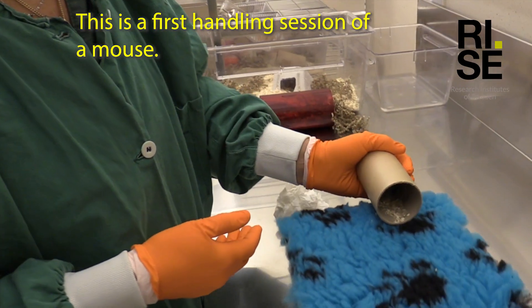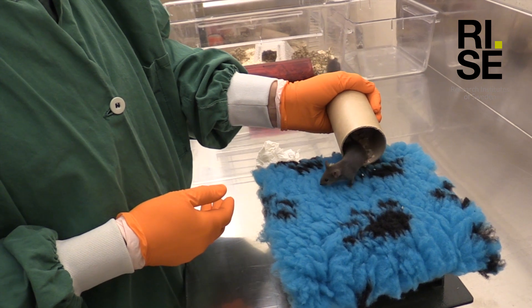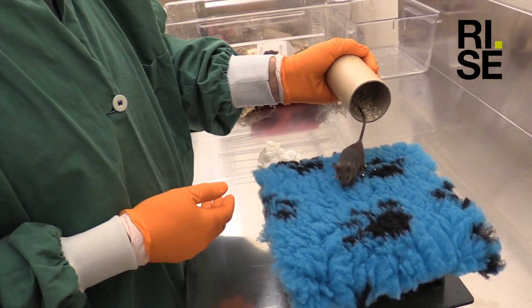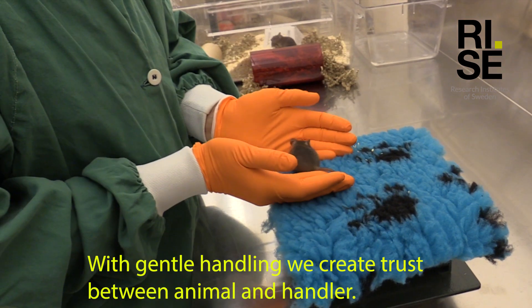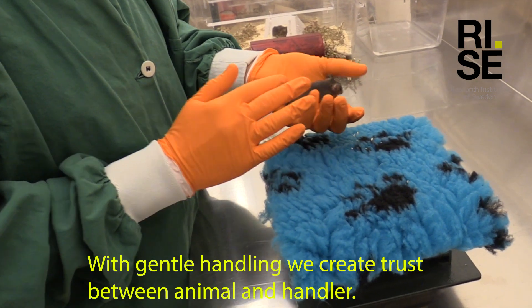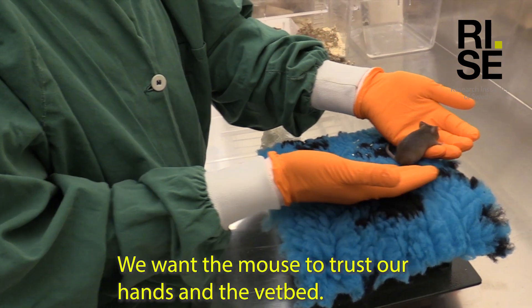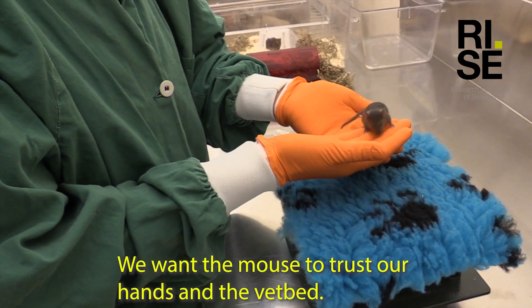This is the first handling session of a mouse. With gentle handling we create trust between animal and handler. We want the mouse to trust the hands and the vet bed.